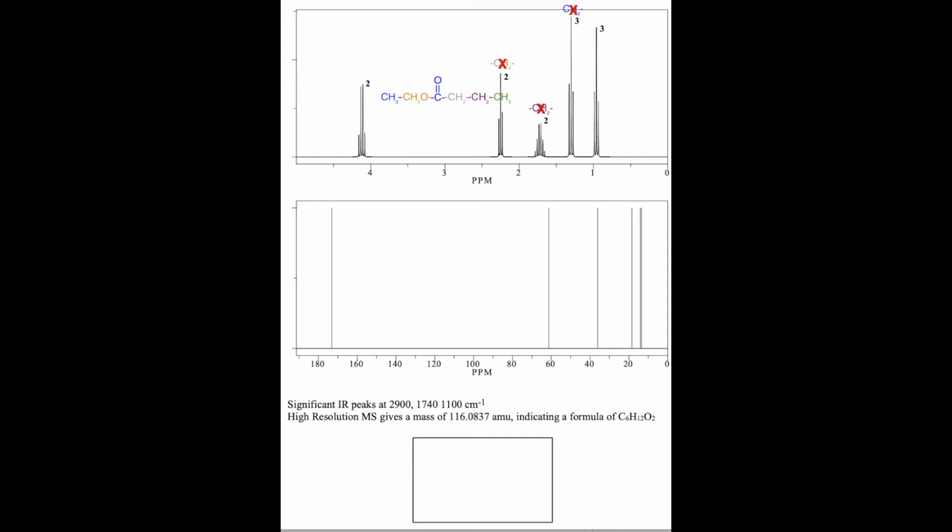And then with the proton NMR, I can see that it has 1, 2, 3, 4, 5 different kinds of hydrogen, all color-coded conveniently. And we saw 5 resonances in the proton NMR. And then I'm just going to start on one end and march forward and make sure all the peaks make sense. So starting from the left, the blue methyl group, that would be a very generic set of hydrogens. I should have a generic CH3 coupled to a CH2 into a triplet. And I do, I have it right here. Put a big X through it already.